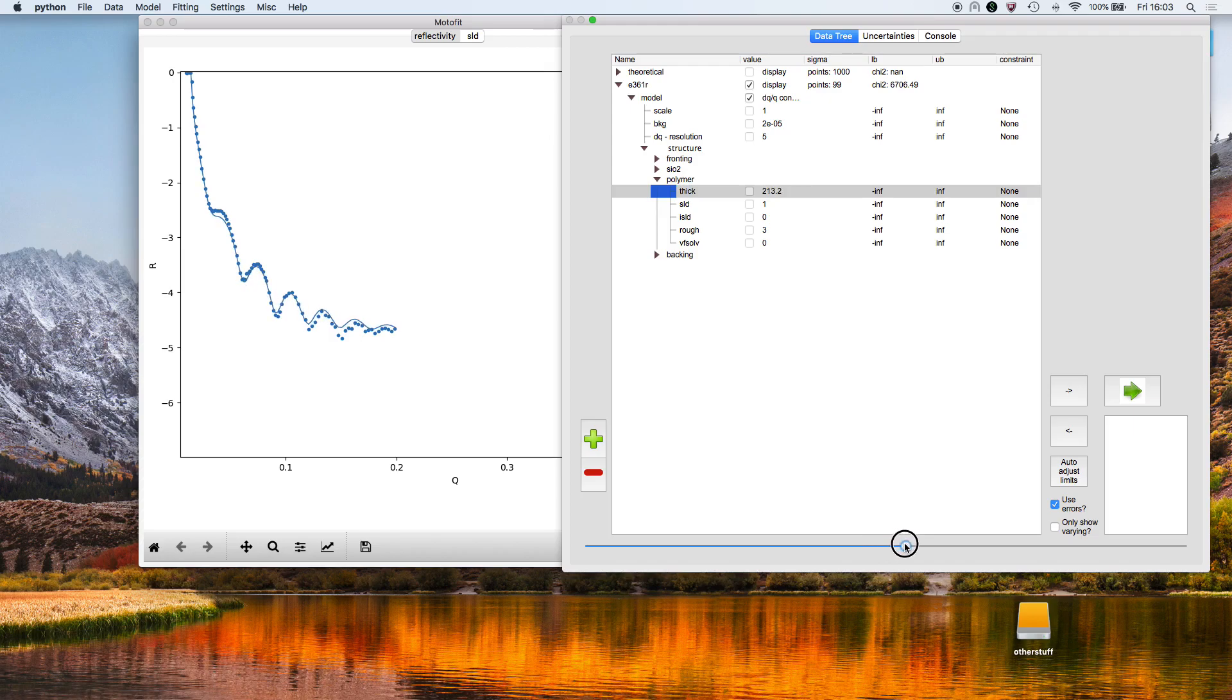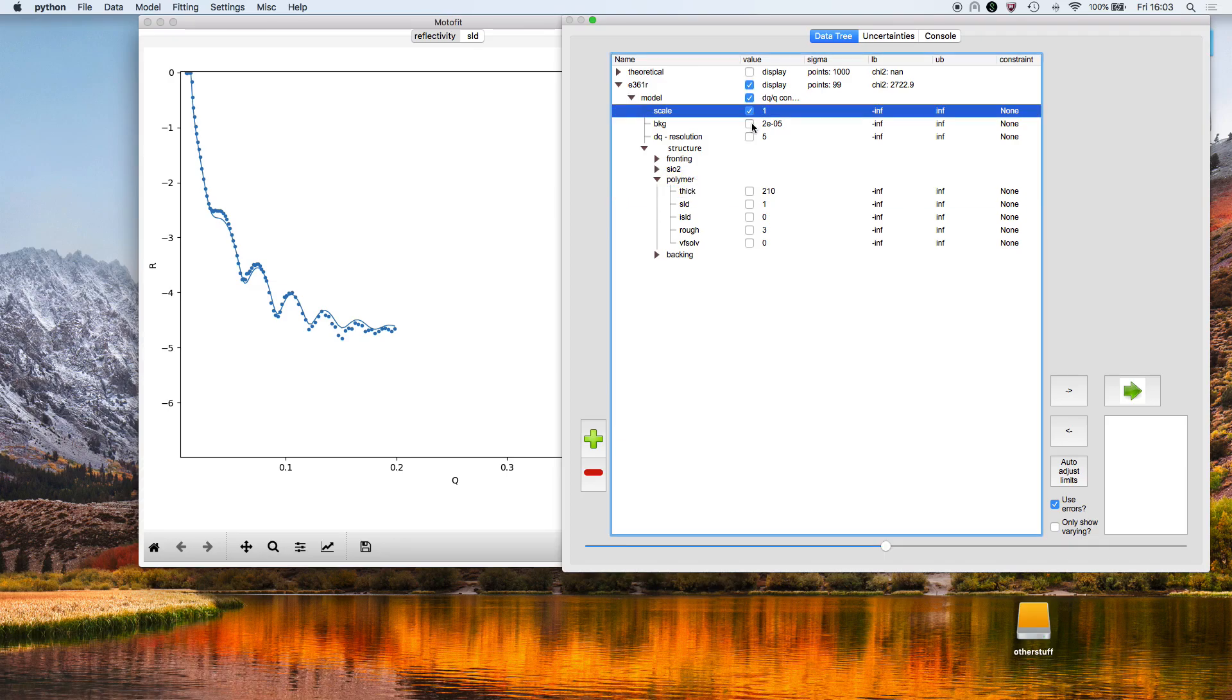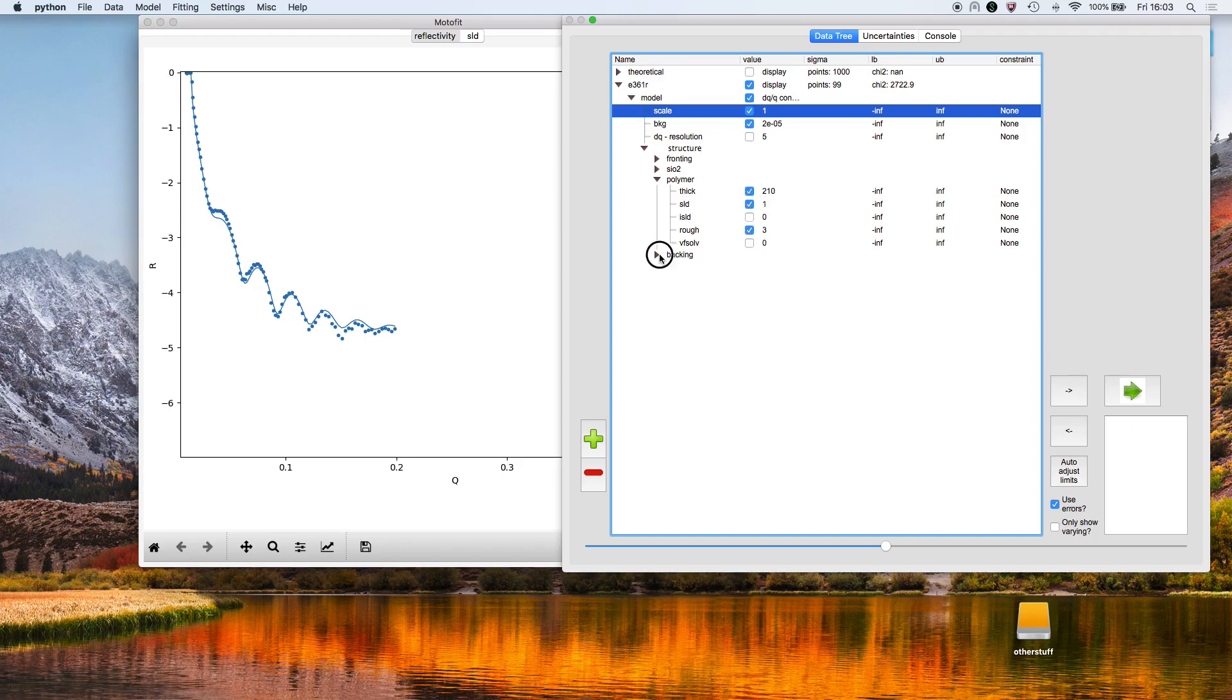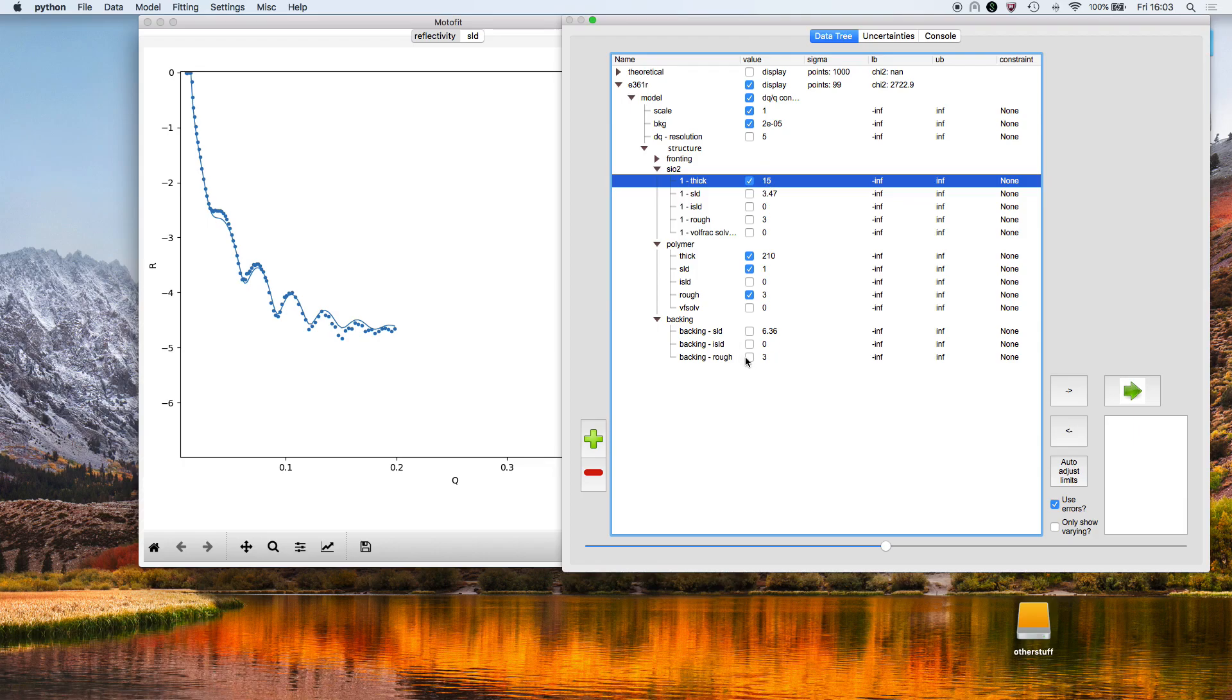I'm then going to select the parameters I want to vary during the fit: the scale factor, the background, the polymer thickness, the polymer SLD, the roughness, the silicon dioxide thickness, and I may allow the backing roughness to vary. So that's the roughness between the D2O and the polymer layer.